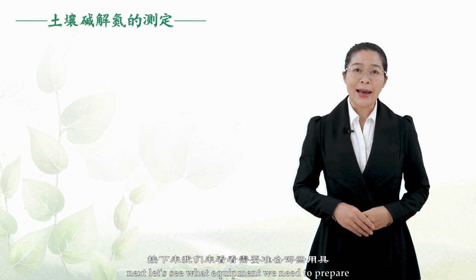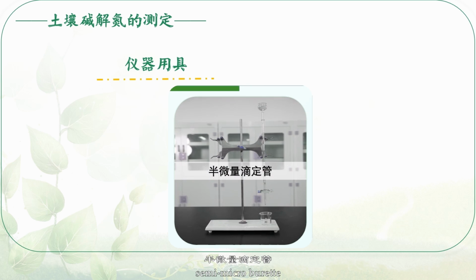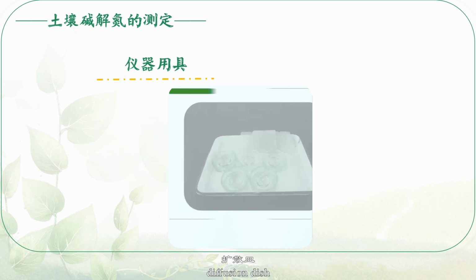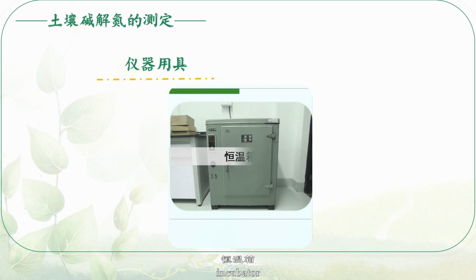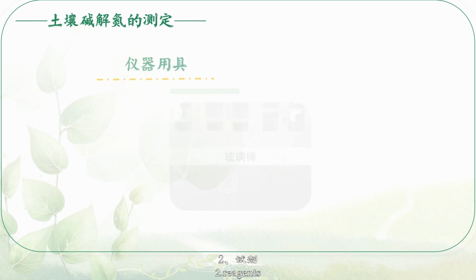Next, let's see what equipment we need to prepare. 1. Instruments and appliances: semi-micro burette, diffusion dish, incubator, titration table, glass bar. 2.